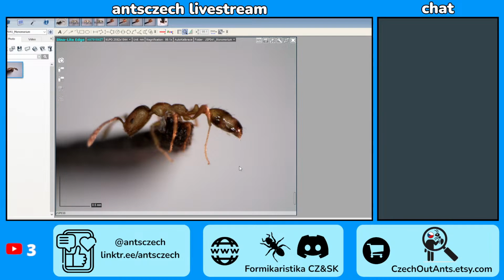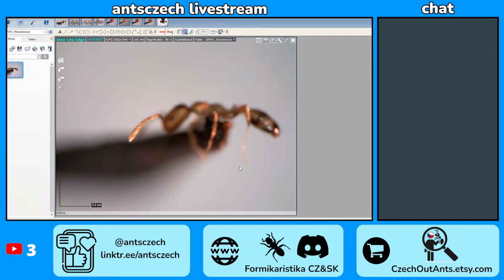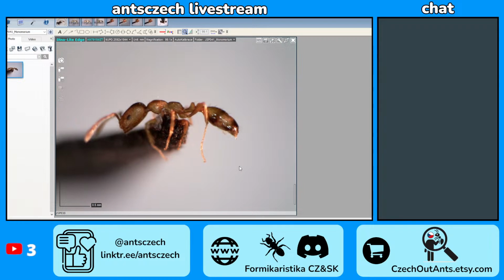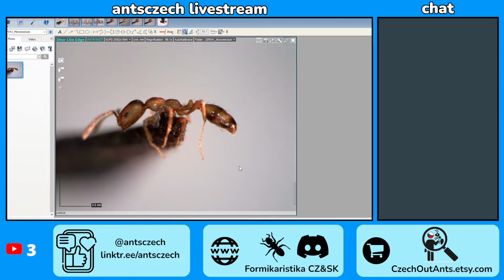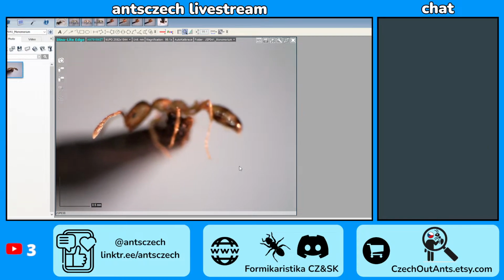Are you pinning right now or doing something? I'm just trying to reposition the leg on the Ponerain. I think it's a Hypoponera, just because most are Hypoponera in the tropics. But who knows?